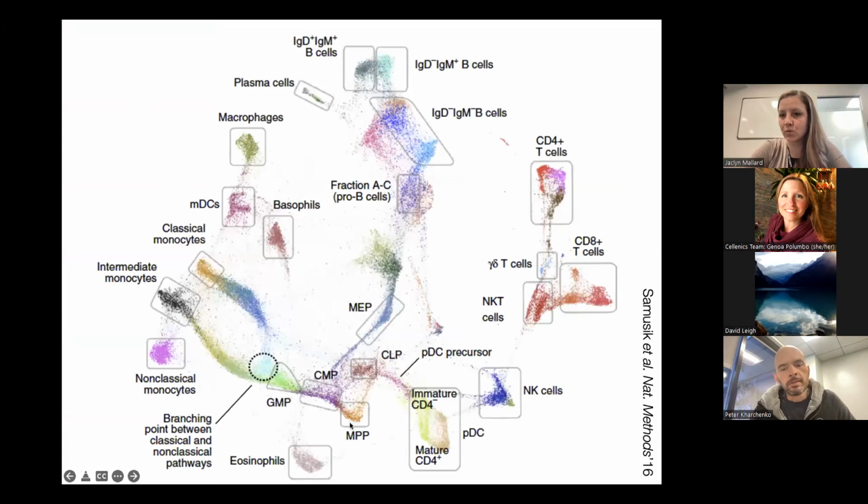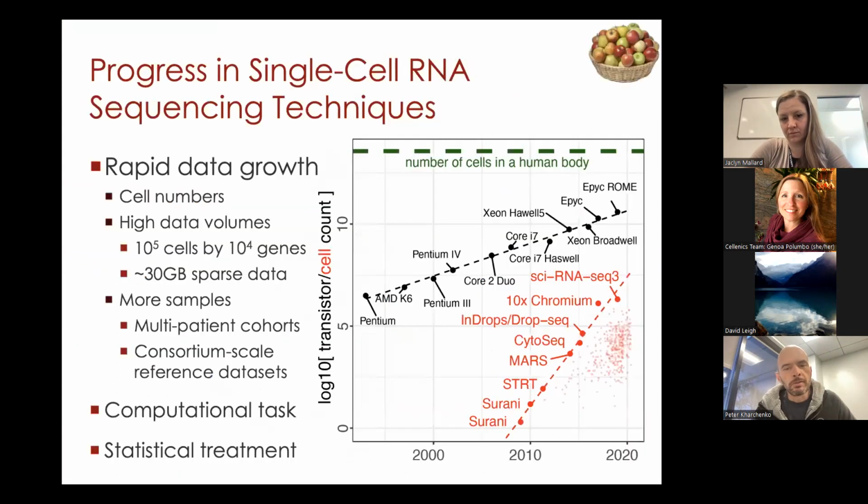So in general, single-cell experiments are very nice for studying complex tissues. This is a snapshot of mouse blood, for instance, and you're seeing not just distinct subpopulations like macrophages, but you can also trace trajectories here and get a sense maybe for the dynamics of the tissue. And this is a single-shot experiment, so it can be quite powerful.